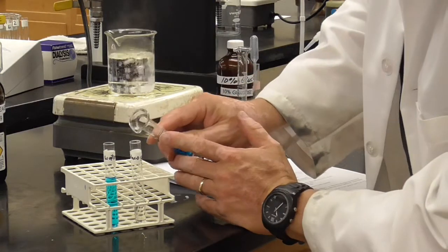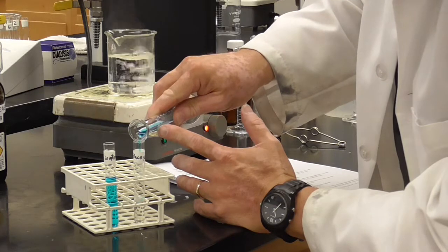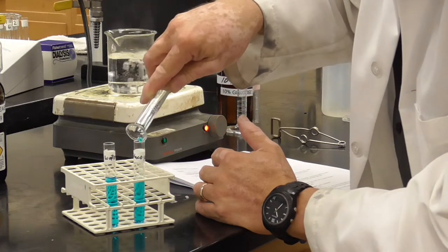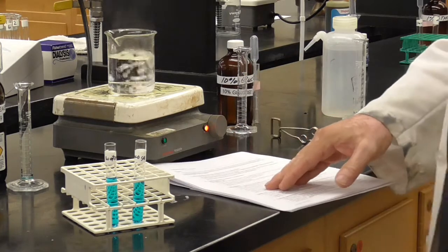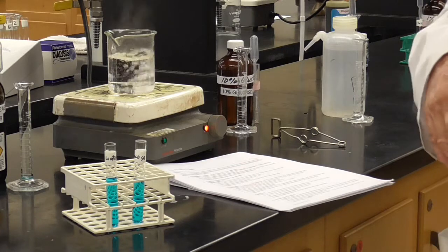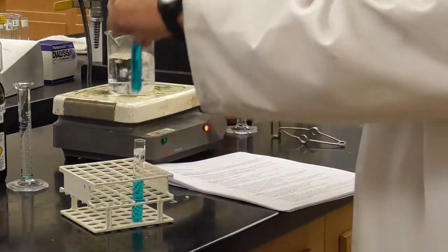Go ahead and add that to this test tube. Well, right now they look identical, but we're not done with the test. If you read further, it says now, heat both of those test tubes in a boiling water bath for 3 to 5 minutes. So that's why we needed this. We'll just go ahead and put them in here.